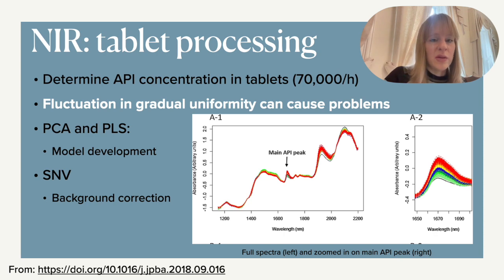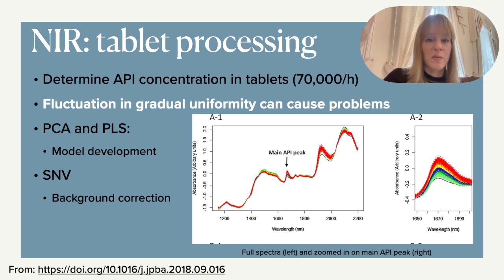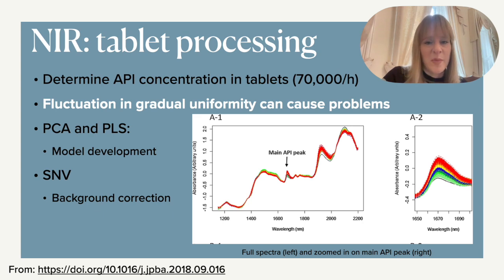If you look at the spectrum you will see a whole range of different peaks. There can also be some drift in the signal, so normally you'd expect a nice straight line. The first thing you want to do is apply some background correction — something like SNV, a method for background correction — to make sure you don't see the influence of that baseline shift. This is likely due to the fact that within your tablet there are many other compounds besides the active pharmaceutical ingredient, such as a coating which might be titanium, and excipients, all of which can give a peak.